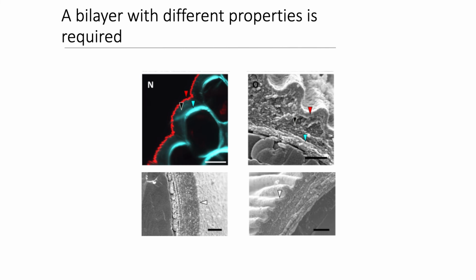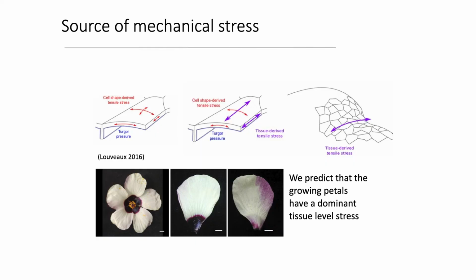And we're trying to test that now by poking at it a little bit with an AFM. And you can see the little layers here. So the layers are very visible on the side that makes them and not on the other side. So that means we are pretty happy that mechanical stress is the cause of striations in flowers, or at least in this flower.